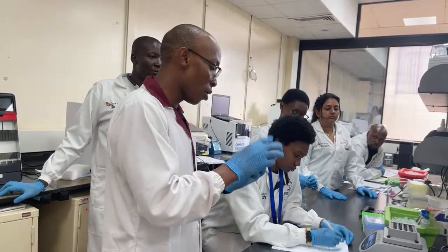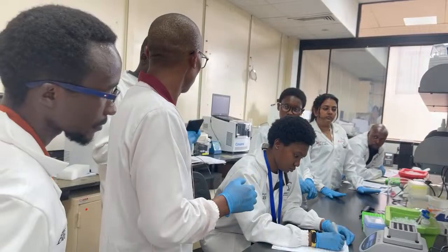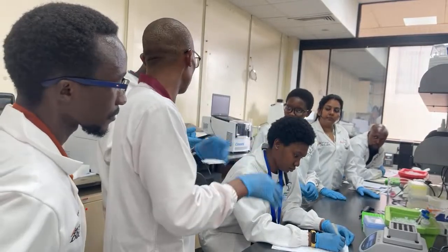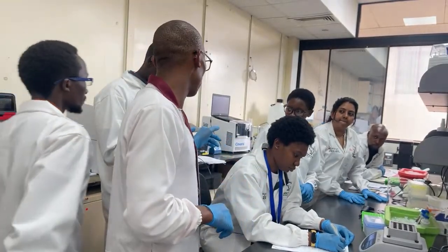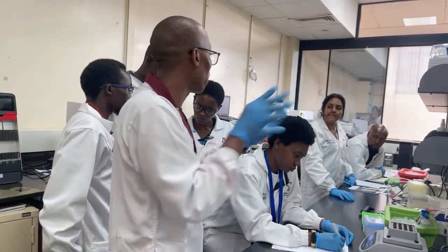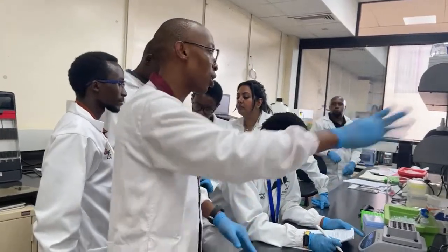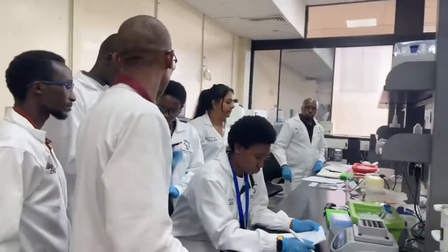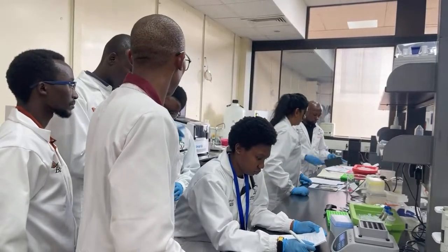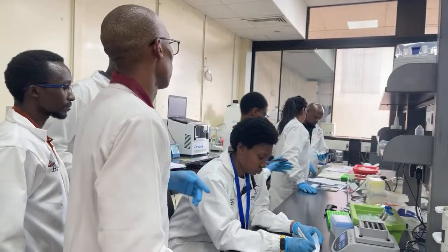So you can just check it, pass this around. You see the microscopic view of this, just random things standing up, so that the DNA can nicely wrap around the channels of the silica. Just let everyone see that.